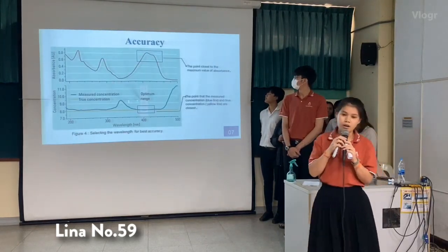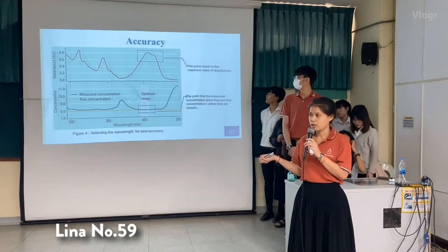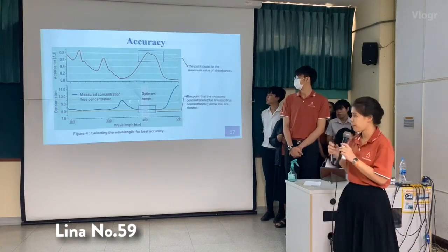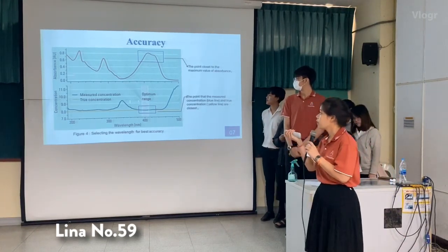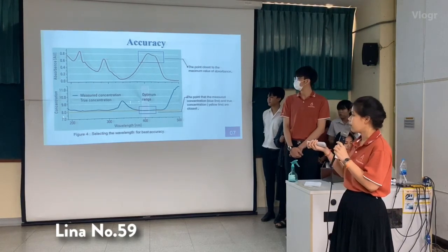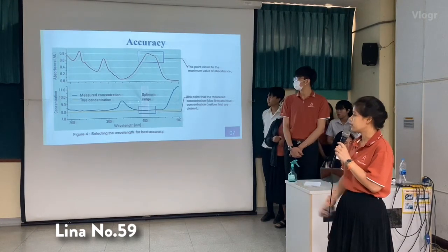From figure 4, selecting the wavelength for best accuracy, the x-axis is wavelength and the y-axis is concentration and absorbance.